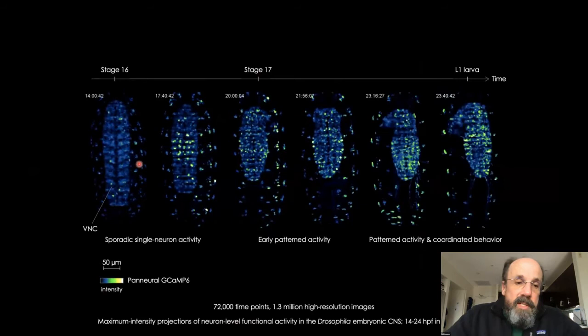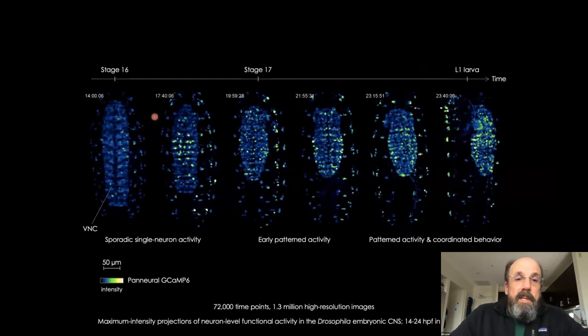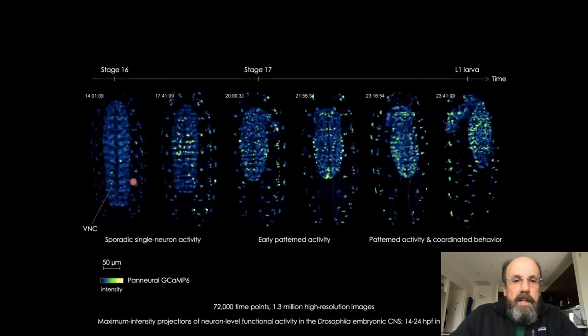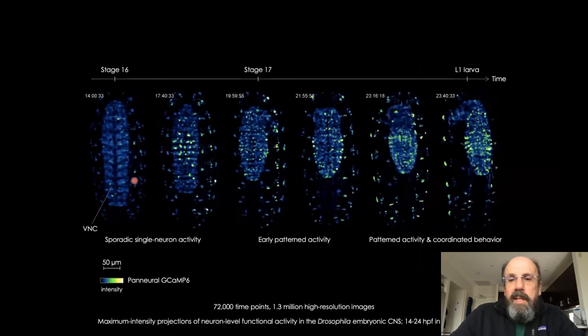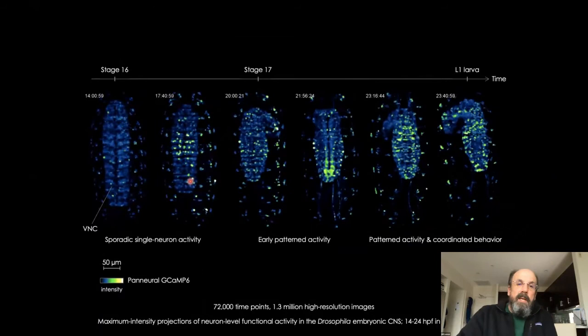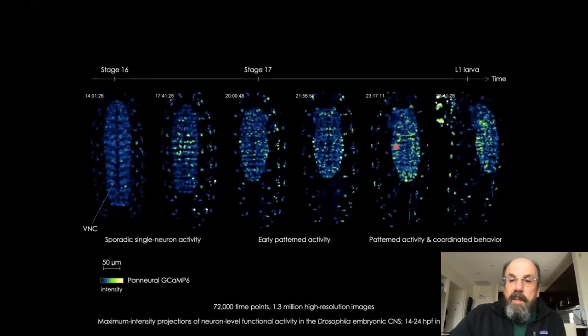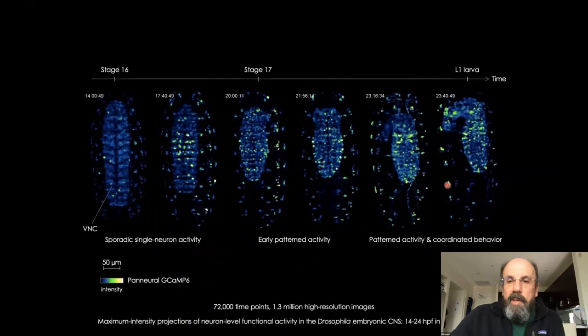It's fast enough and gentle enough that we can image for many, many hours. This is 10 hours of imaging in a Drosophila embryo — just the last 10 hours of development. You can see the onset of neural activity from GCaMP signals at stage 16, with more signals as the animal gets older. Late in development you start to see coordinated waves of activity proceeding up and down the nervous system, and eventually the animal gets coordinated enough that it can crawl out of the field of view.